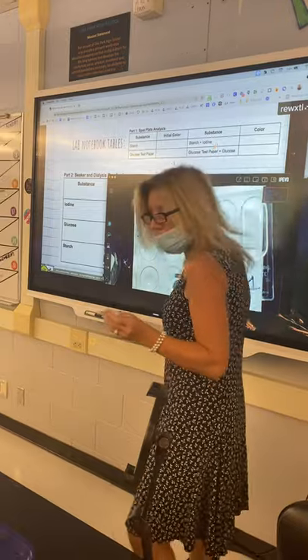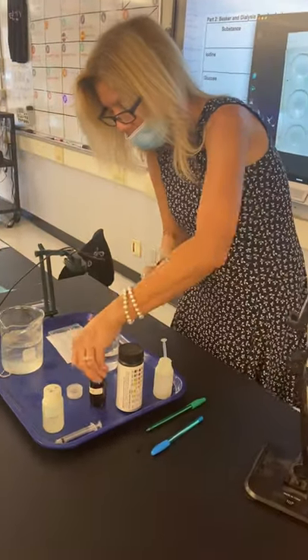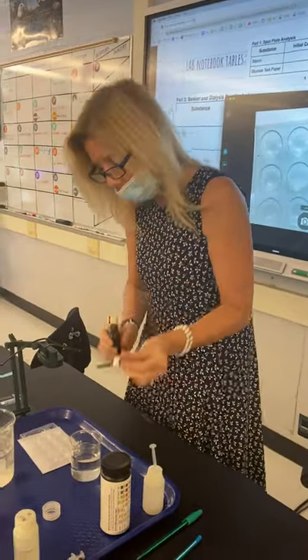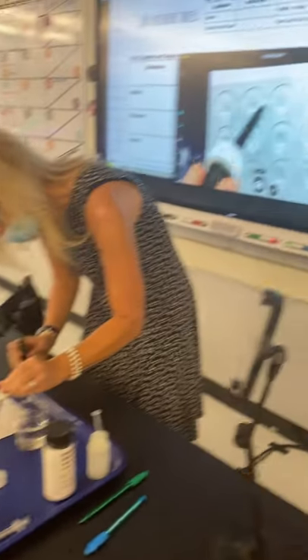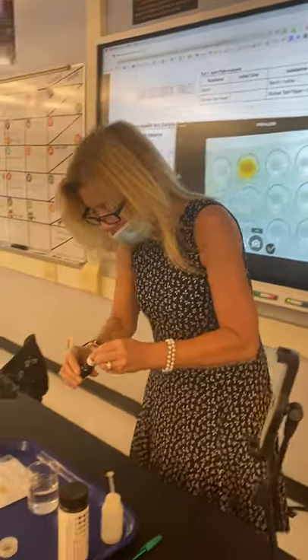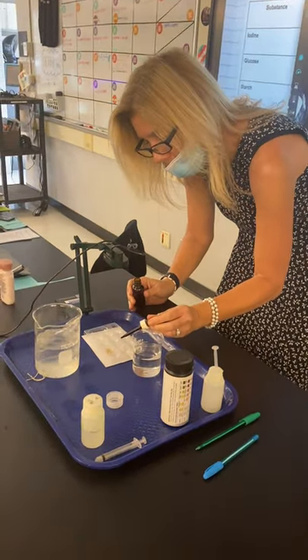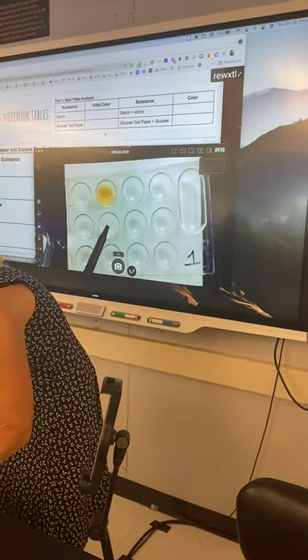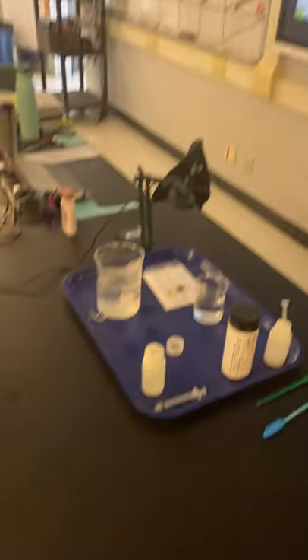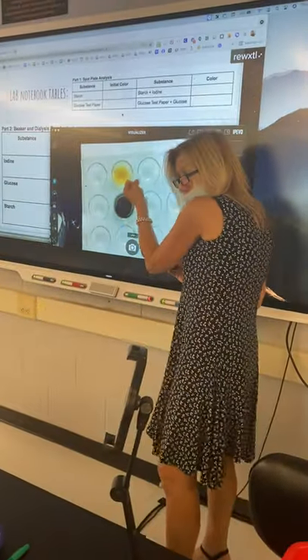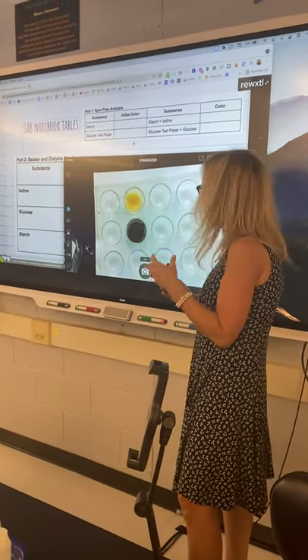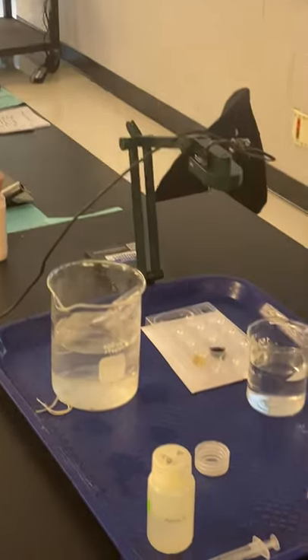I'm going to mix some starch with some iodine. I want to show you what the iodine looks like — here's a bottle of iodine. I want to show you first what it looks like by itself. Can you see the iodine? What color is it? Yellowish orange. So now I'm going to put some of it in the starch. Can you see how the iodine changed colors? So that's your hint — when starch and iodine are mixing, the iodine is going to turn that dark blue color. So starch plus iodine is dark blue.